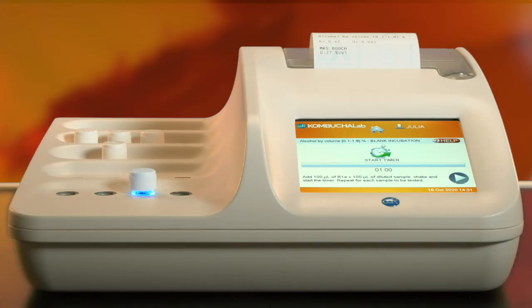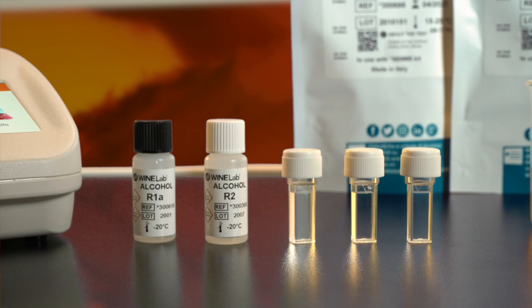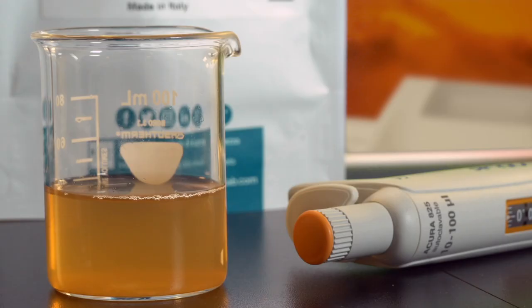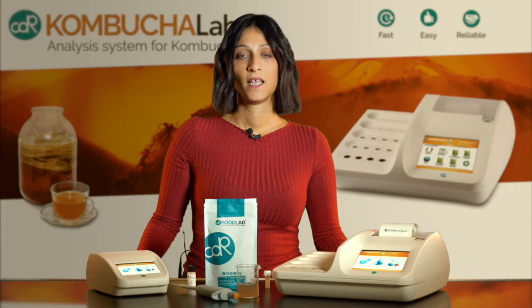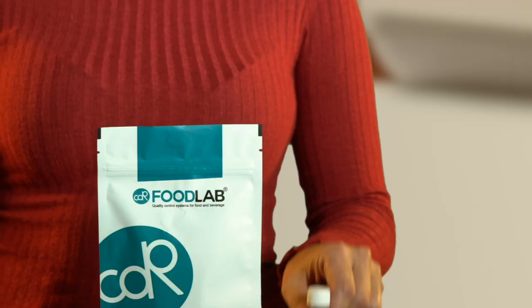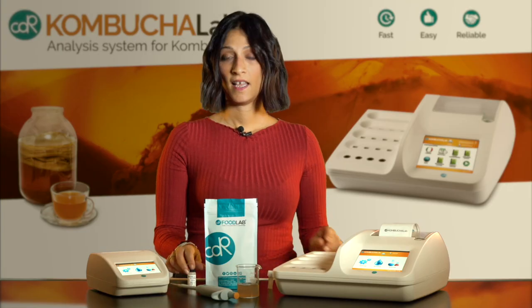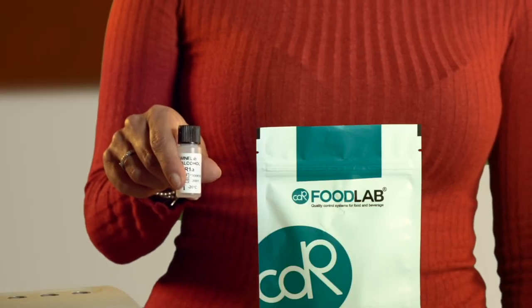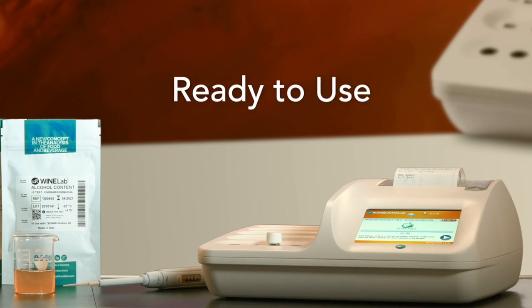In addition to CDR Kombucha Lab, all you need are the required pipettes that are included with the analyzer, the specific kit of the test that you want to perform, and of course your Kombucha. CDR provides a specific kit for each test. The kit includes pre-filled cuvettes and secondary reagents.